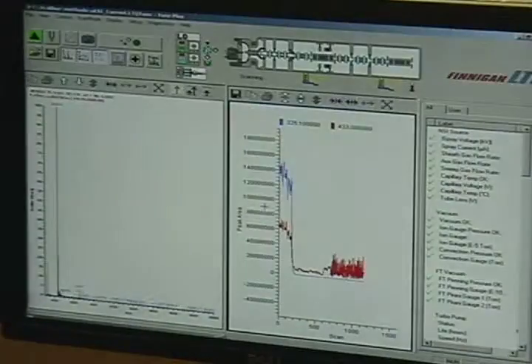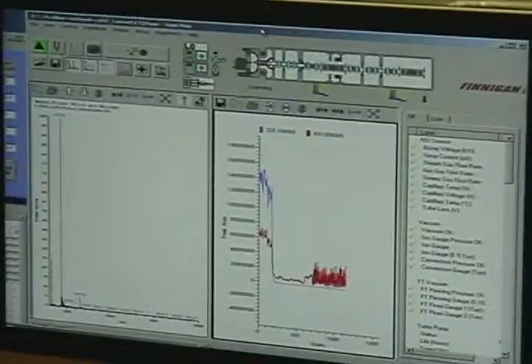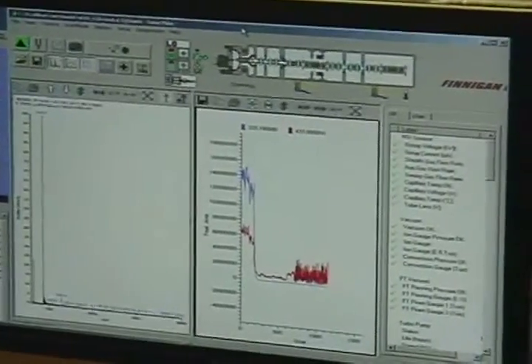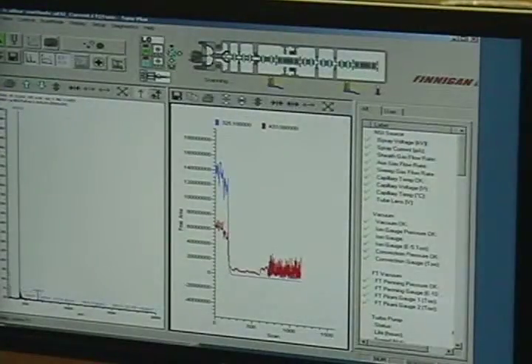So, shall we tune? How's your injection time? 0.2. Looks good. Looks nice and stable. Yeah, go for a tune. You already have it open somewhere. Where are you, Mr. Tune? Check the camera. Is the audio coming through fine? Cool.